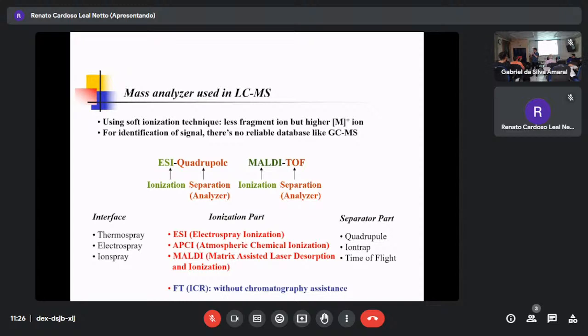Then I can use a corona device. I give electron volts to the chloroform, and then the chloroform hexane is ionized in a short time. They work like water, so that's why they can do what is needed. Ideally, APCI looks better, but APCI has limitations, and the robustness of ESI is better.